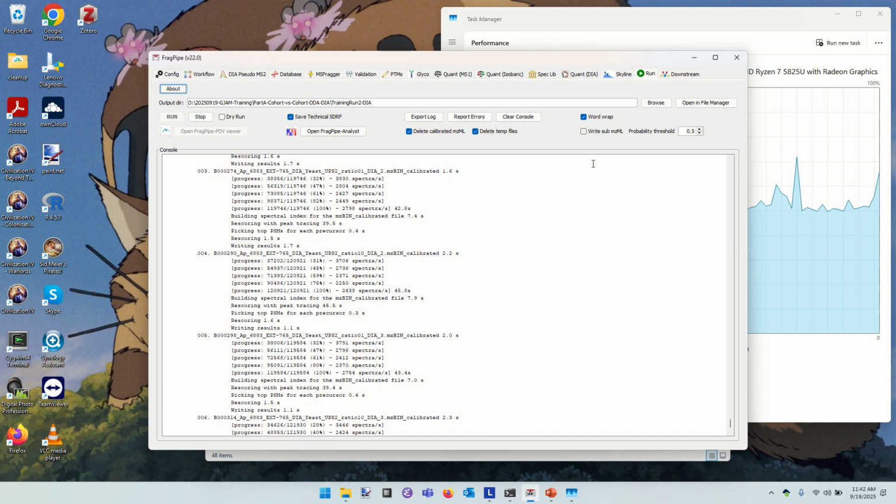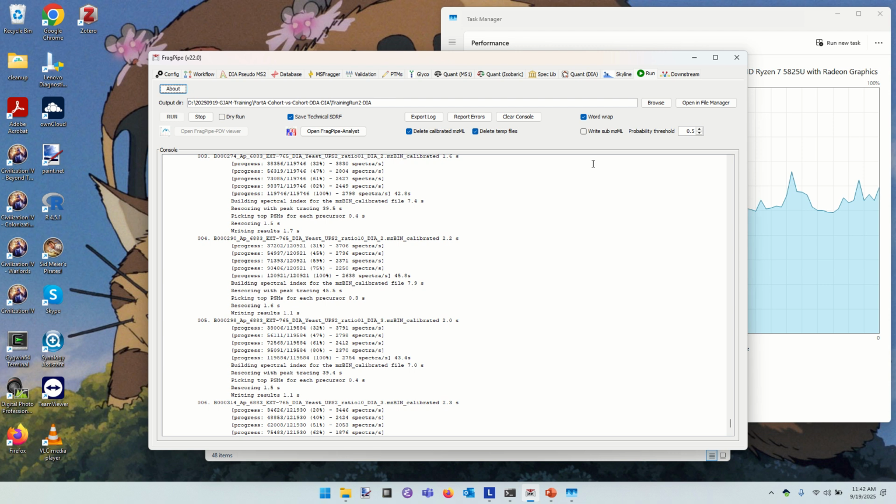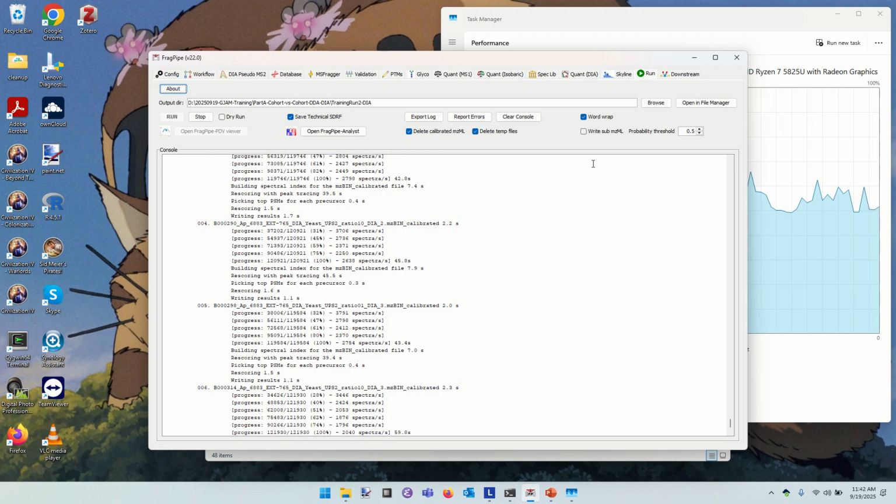Still working on it. I have to say, there's this challenge when you're doing a training and you are recording video on the laptop as you're running the software on it. You end up using a processor core just for recording the video, and cuts into the performance time of it. Consider whether you want to do the TV kitchen thing of a pre-baked one. Yes. Yes, we frequently do that. When we taught a demonstration on top-down proteomics recently, we provided them the outputs that they would get from, if you ran the search on all 6, this is what it would look like. It's going to make it, though.